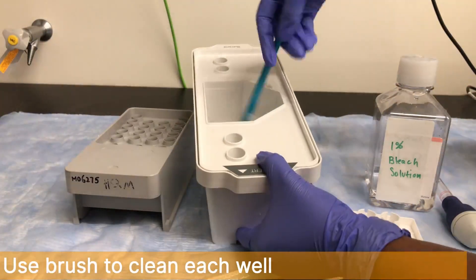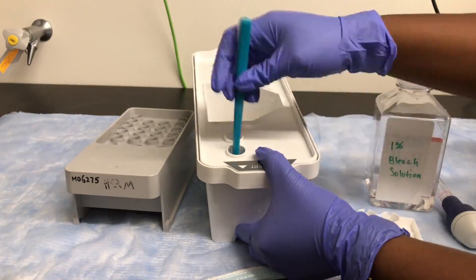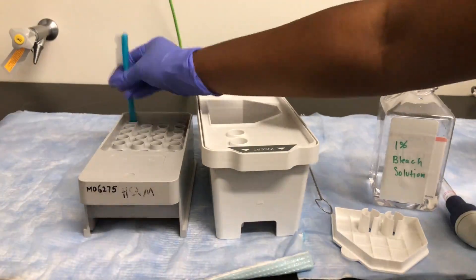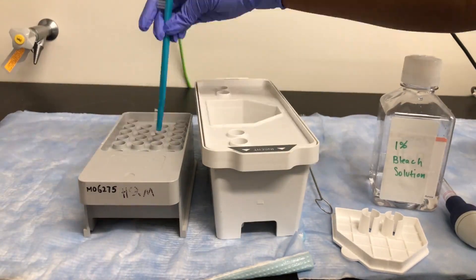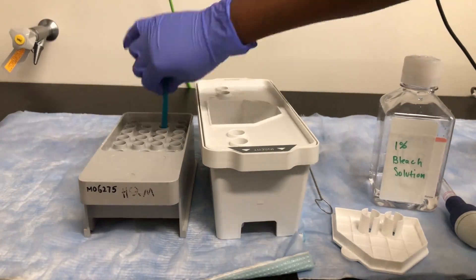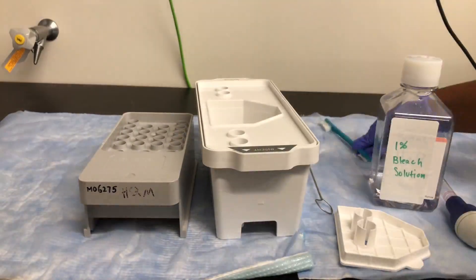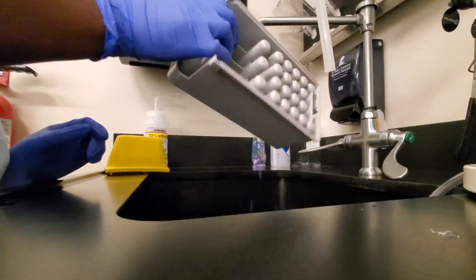Use a brush to remove the buildup from the wash cartridge wells. Thoroughly rinse the wells.